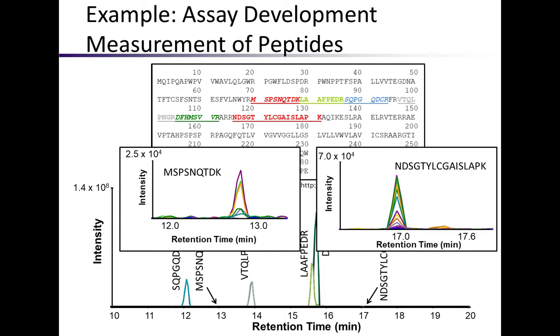So here's our first chromatogram of the seminar. On the x-axis, you see retention time over the course of the experiment. For those of you that are familiar with discovery proteomics and targeted proteomics, you can see here that this is a 20-minute experiment, whereas a lot of discovery experiments are 2 hours plus. So this is much faster than a discovery experiment often is. On the y-axis, we've just got the intensity, and we're measuring the intensity of each peptide over time.